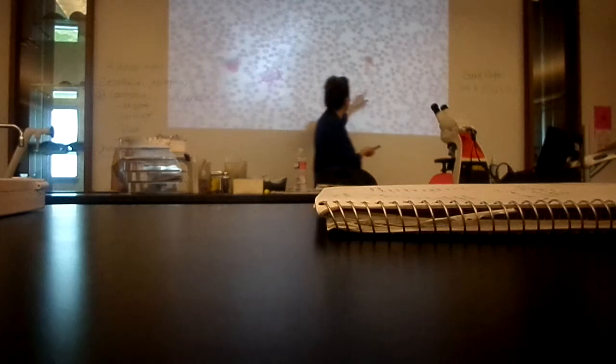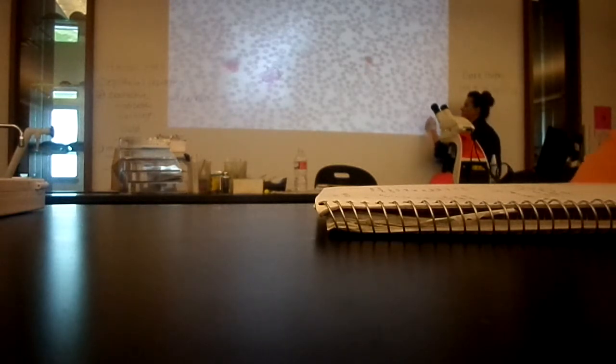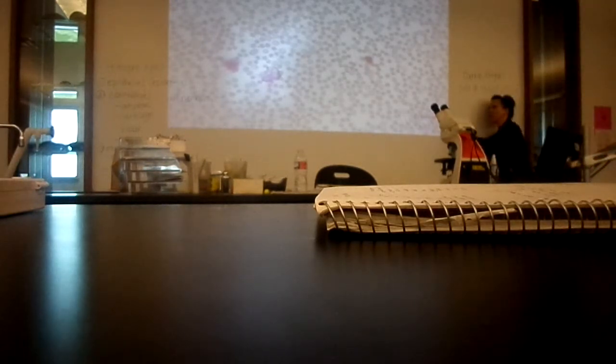The most numerous ones that you see here, these little red spheres, these guys are erythrocytes. Yes, they are your red blood cells, but we're in college now, not in the 5th grade. Erythrocytes. Okay? No, we're not in the 5th grade anymore. Erythrocytes. What's the function of the erythrocytes? What do they do? Transport oxygen. All right?